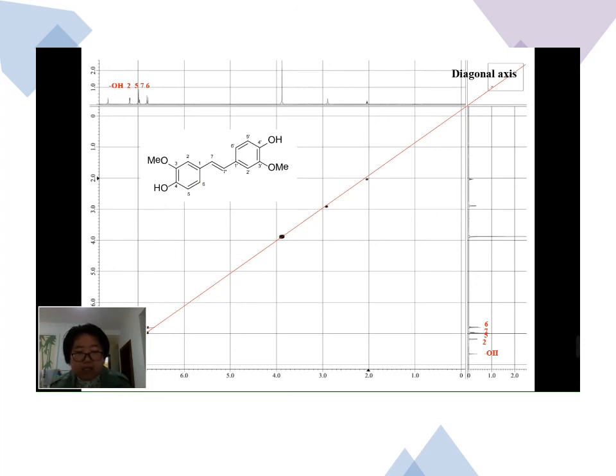The signals with larger chemical shift are distributed on the lower left of the diagonal, and the signals with smaller chemical shift are distributed on the upper right. Any modulation of the signal, such as coupling interaction between spinning nuclei, appears on both sides of the diagonal in the form of cross peaks.